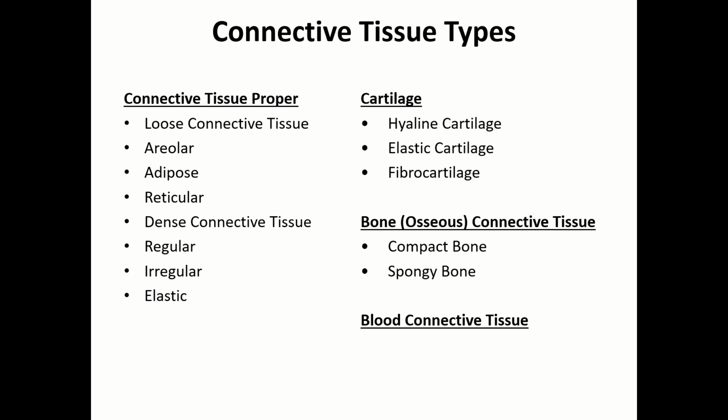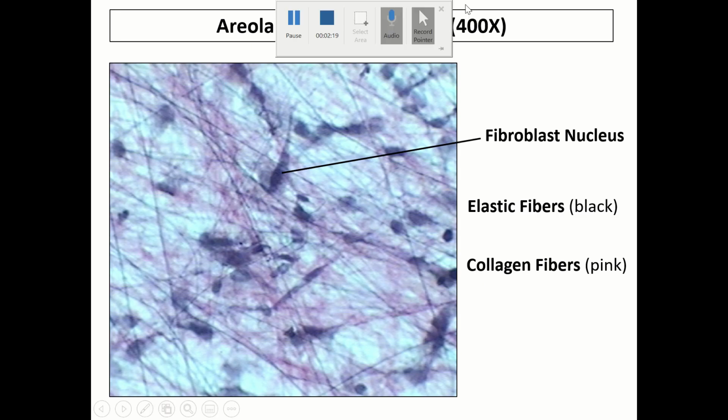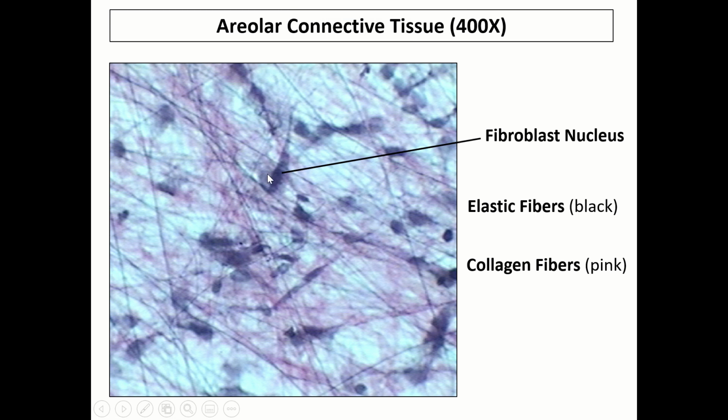We're going to start with our analysis of connective tissue proper, looking at loose areolar connective tissue. So at 400x magnification, you can see here the individual fibroblasts, which are the cell that's most predominant in this first slide. It has a dark oval nucleus and a long fibroblast shape right over here that looks like a tapered end on either side. Again, the nucleus is what stains the most darkly here, and so that's what you tend to see more of as you look throughout the slide.